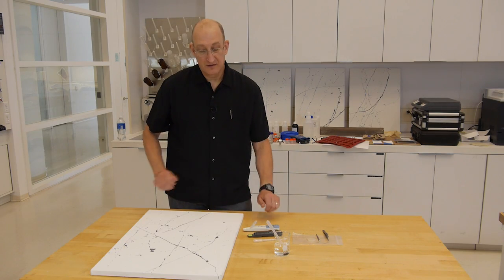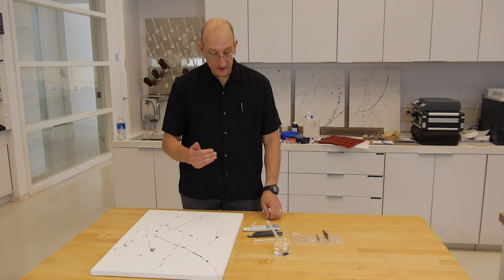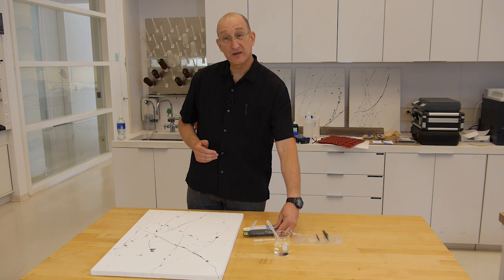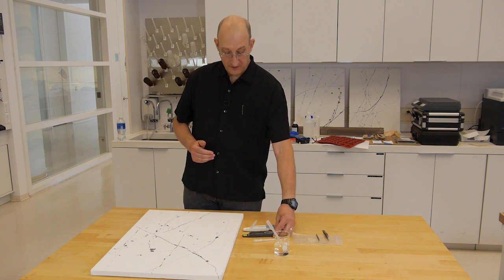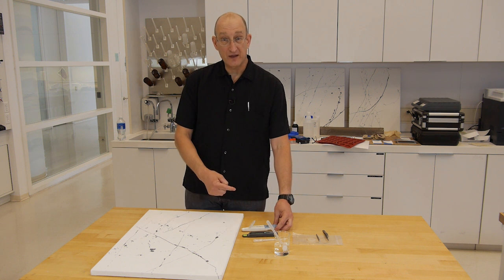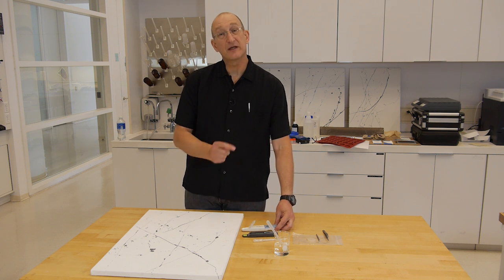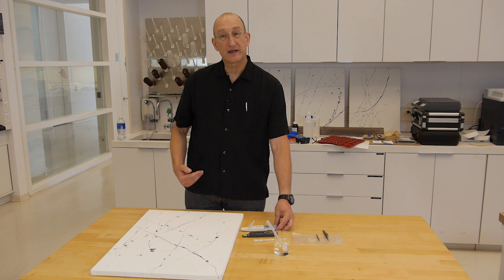We're going to wait a minute, and then we'll pick that up, put it into the calibrated conductivity meter, and then when we have a reading, we'll transfer it out of the calibrated conductivity meter into the calibrated pH meter and get the pH reading.